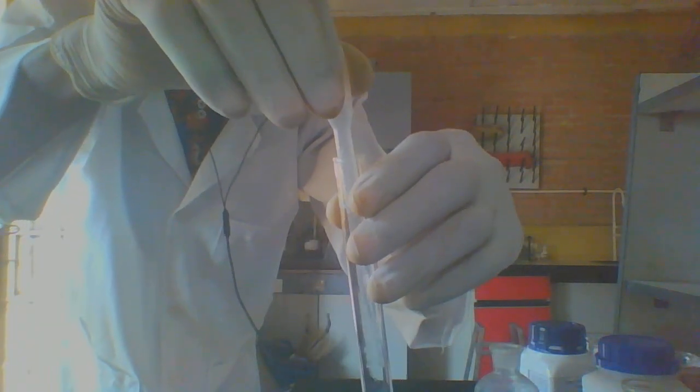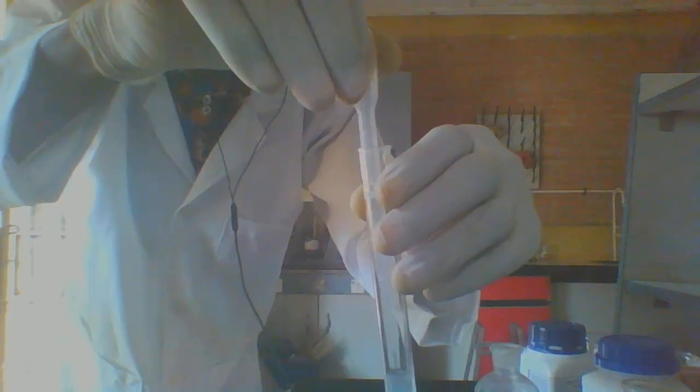How do we distinguish between them? We use this, aqueous ammonia. We use aqueous ammonia in drops and in excess. If it's calcium ion, we will not observe anything. But with lead(II) ion, we're going to observe something. Okay, let's see. Can you see the white precipitate again?